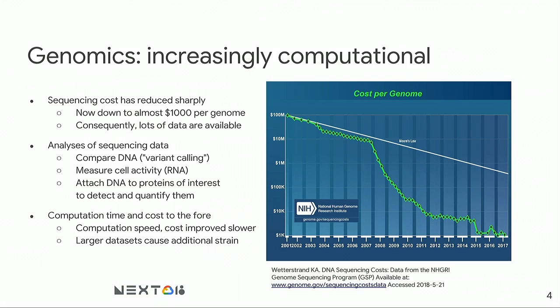Another thing that people do is because this instrument works so well, we use it to measure other things. So we use DNA sequencing to find proteins. The way this works, just briefly, is we can, and by we I mean the field, we can engineer, hopefully I get this right, I'm a computer scientist, right? So we can engineer an antibody that will attach to this particular protein, and we can attach a bit of DNA to it. So what we do is we just mix this in the blood or whatever we're interested in, and then we wash the remaining liquid off, and then we sequence it. And so if that particular protein was there, then the antibody attached to it, and then we'll find the DNA that we're looking for. So you can read DNA in order to find proteins or things that are not directly related to people's DNA. Okay, so this is why I'm very excited about reading DNA.